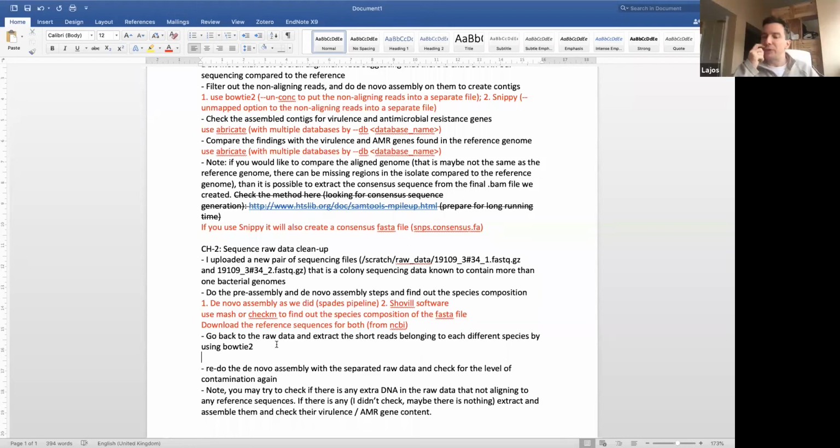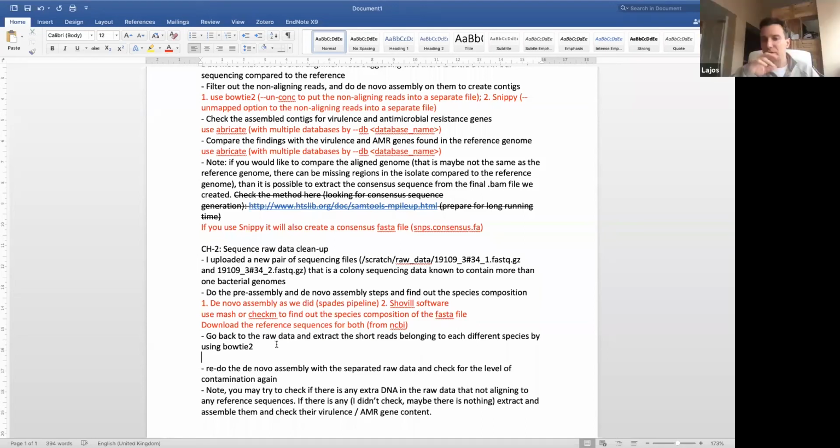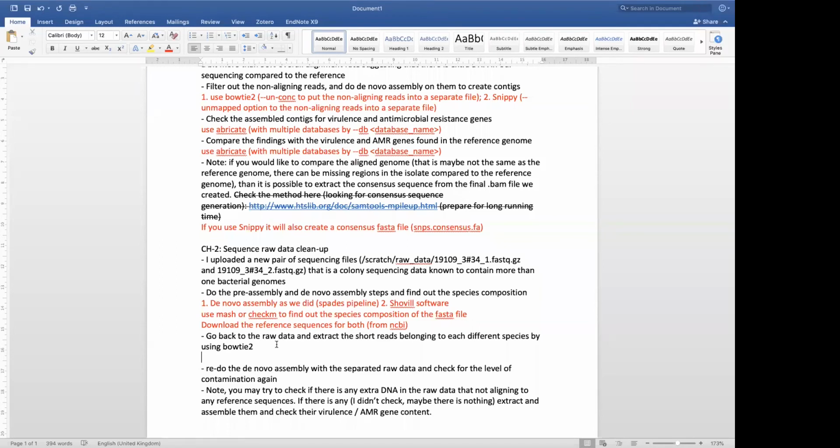And if you do the second so-called purification, just spread again one colony. Do you only pick up one colony at the end? Yeah, you always pick up only one colony, because when you are culturing for DNA extraction, you just pick one colony from a plate.